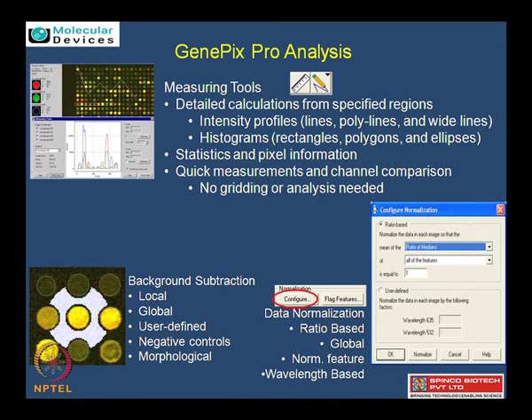And we also have a global background. At any other place, a hole in the chip where the spot is not present, the different background levels can be calculated at different specific positions. Now this can be used to calculate the global background corrections. As you elaborated in the last lecture, there is also a user defined one.